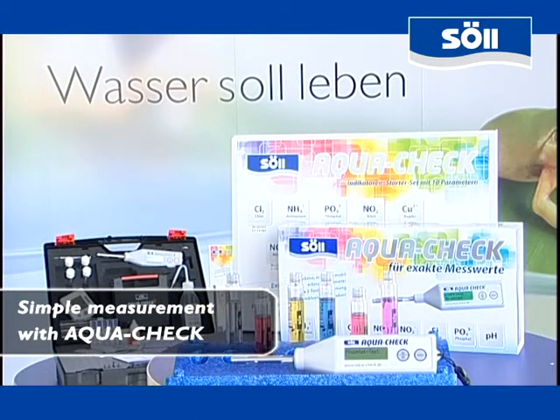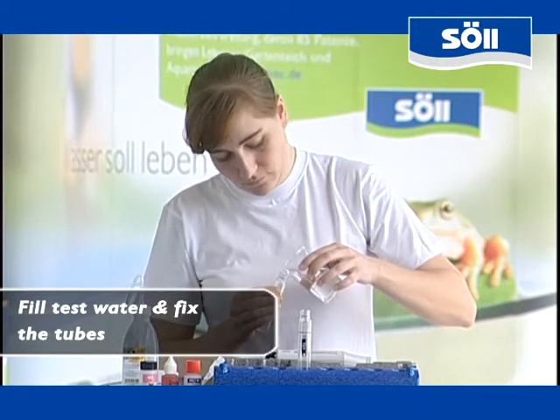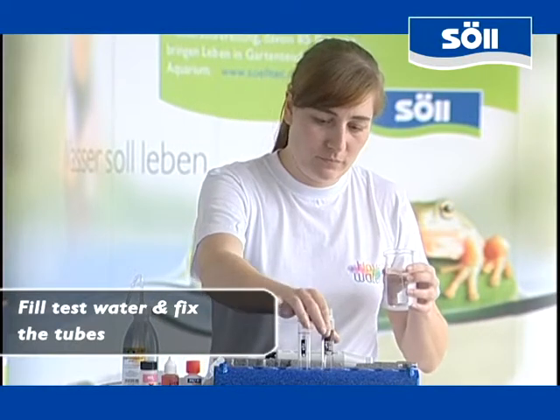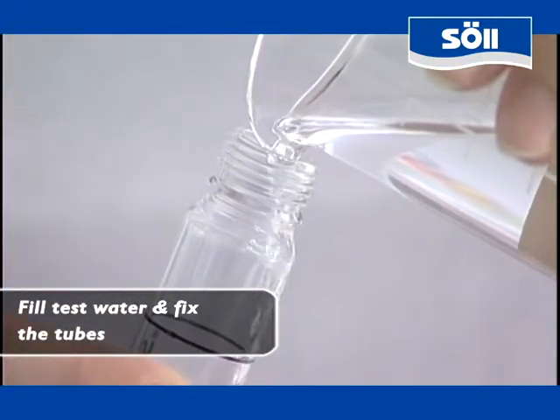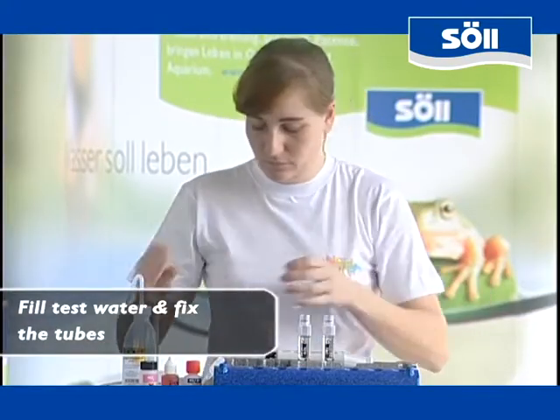Irrespective of the substance you are looking for, you always have to measure twice per parameter. That is why always two of the sample tubes included in the AquaCheck sets are to be filled with the test water. To make sure that the tubes are firm during the analysis, we recommend that you put them into the holes of the mini-laboratory. Please watch that the water level matches the black mark in each of the tubes.